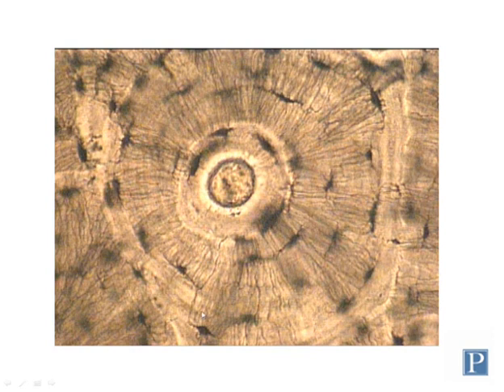These are actually very tiny canals that appear black because, again, they've trapped bone dust and air in them. The name for these tiny little canals is canaliculi. Canaliculi connect multiple lacunae, and they provide a communication network by which individual osteocytes trapped within their lacunae can communicate with one another.